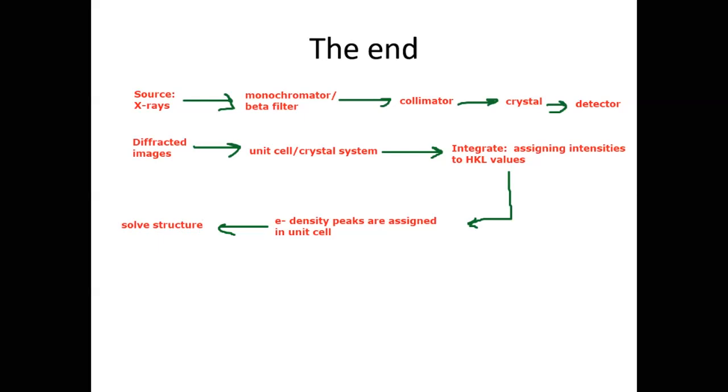A lot of this we talked about, the top part, going from the source to the detector. From diffracted images to solving the structure, we'll do most of that in the second half of the semester, but this is just to give you an idea of the process that goes into solving crystal structures.